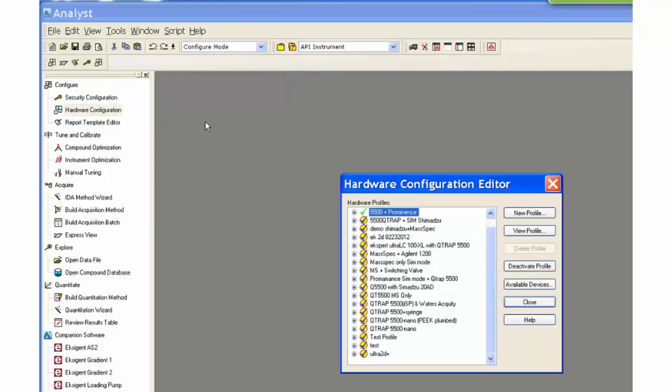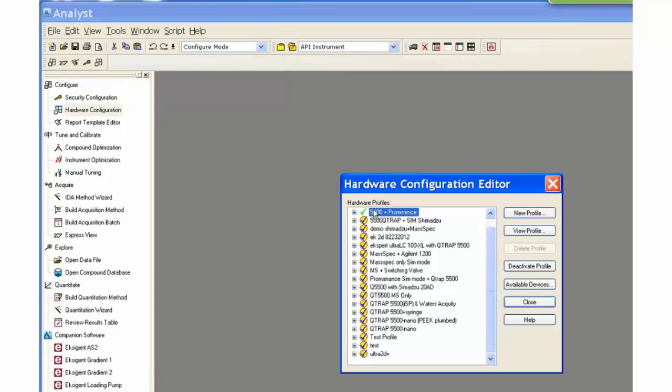In order to create a method with peripherals, the proper hardware profile needs to be activated. A hardware profile with a Shimadzu LC will be used.